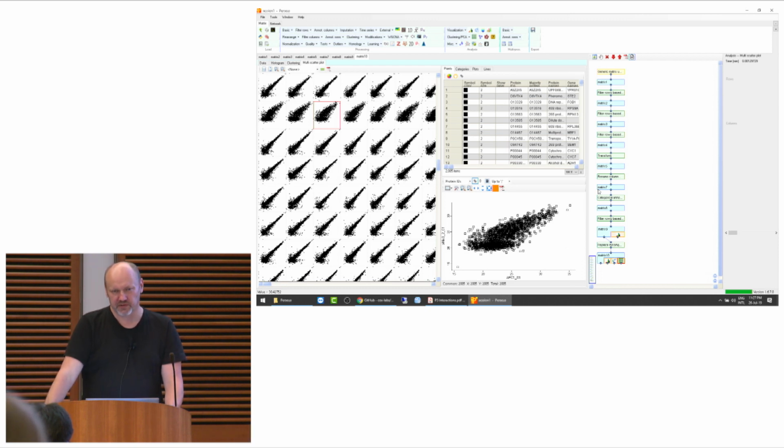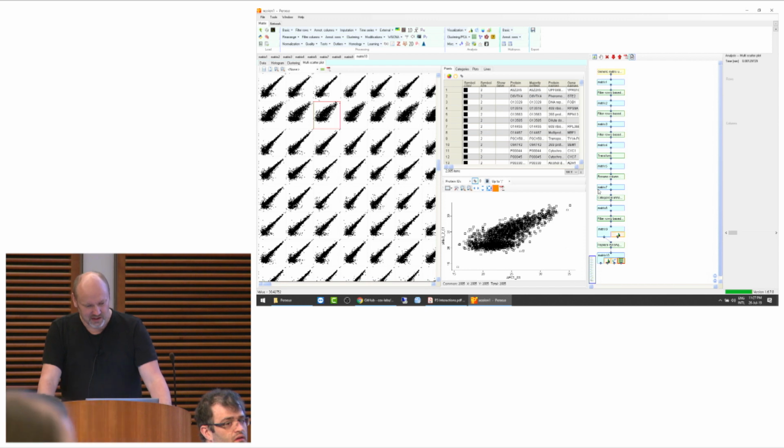So you mean if you have like an organelle specific background? You're hoping to have fractionation or something. Organelle specific proteome, yeah. But there was contamination in a few samples, contamination from the rest of the cell line, right? And on top you do these pull downs, or so you do some organelle? Okay, that was a different topic basically. So yeah, what can I say? Now you have contaminations in one of your organelle pull downs.